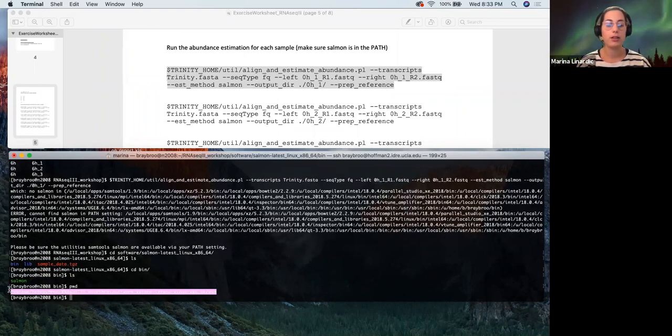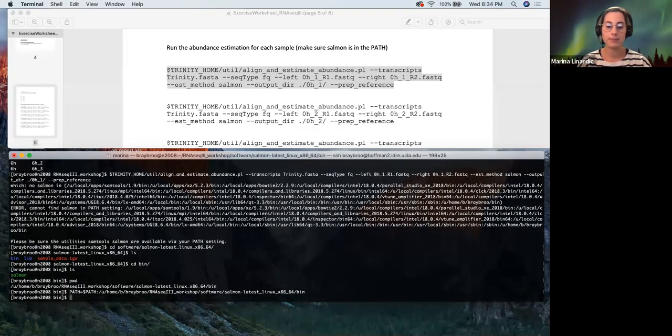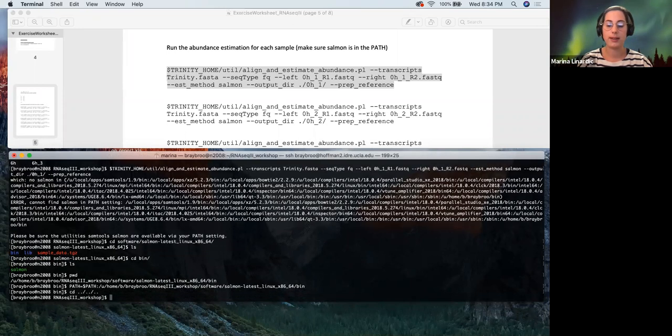We're going to take this. We're just going to put it in the path like we did yesterday. So we put path equals $path, colon, and we paste this like that. And then we go back to our workshop folder. So that should be 3 levels up. Yes.